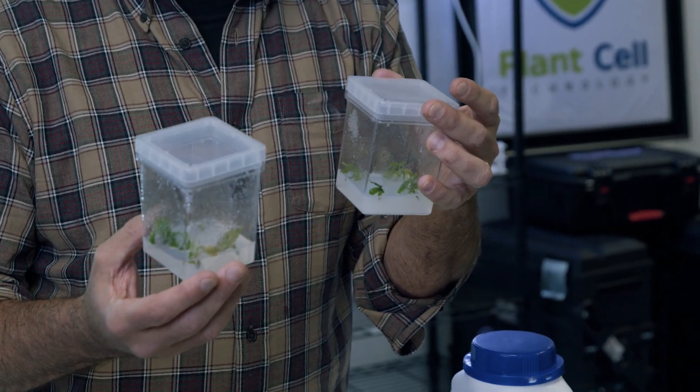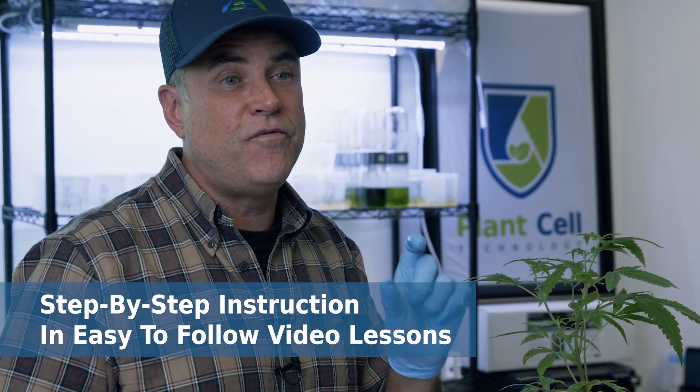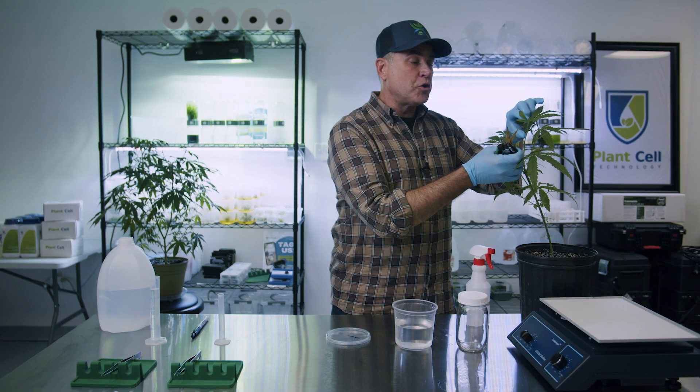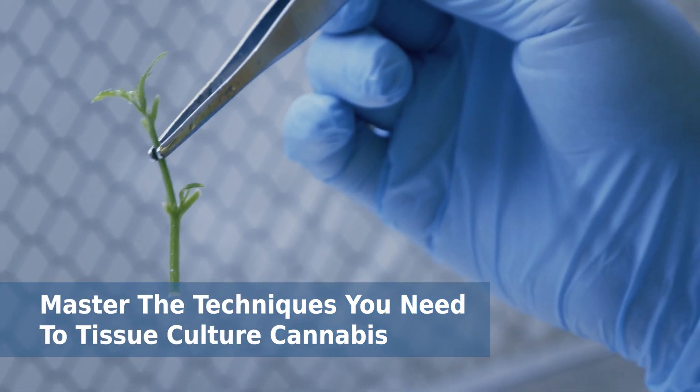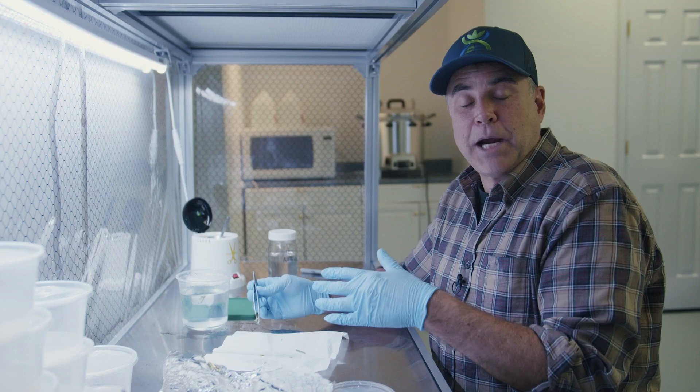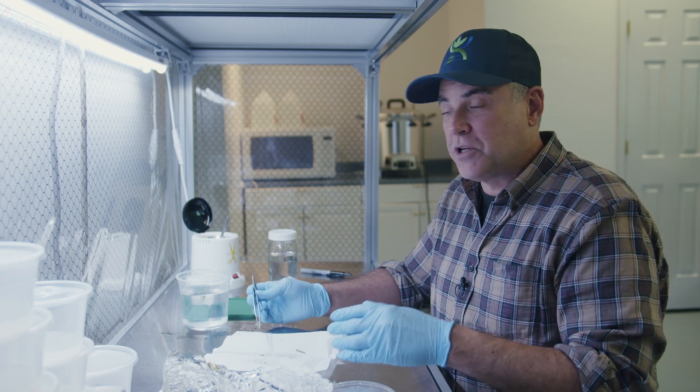I highly recommend using tips of the very best veg plants. We're going to start with a little larger piece for beginning growers — just a simple snip, gripping it about halfway down. I'll be able to stab it directly into the tissue culture media.